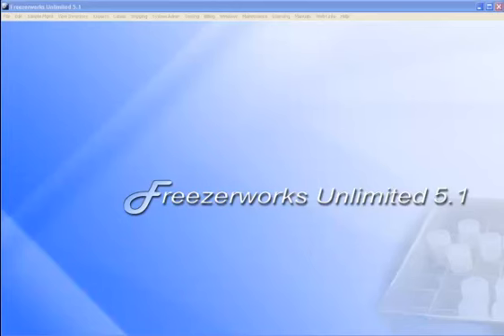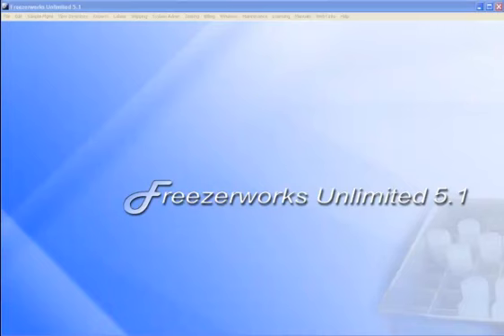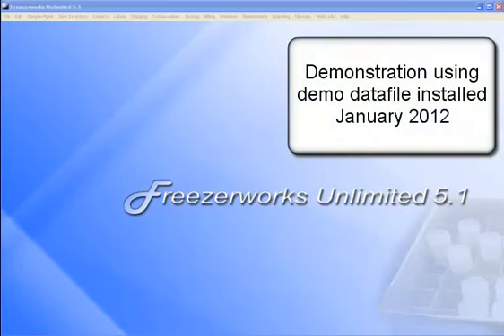Hello, this is Rick Michaels from Dataworks Development, and you're watching a demonstration of Freezerworks Unlimited 5.1, our very latest version of Freezerworks. The version I'm showing you is the version that has been installed on your Computype laptop. It's a pre-beta version of Freezerworks 5.1.